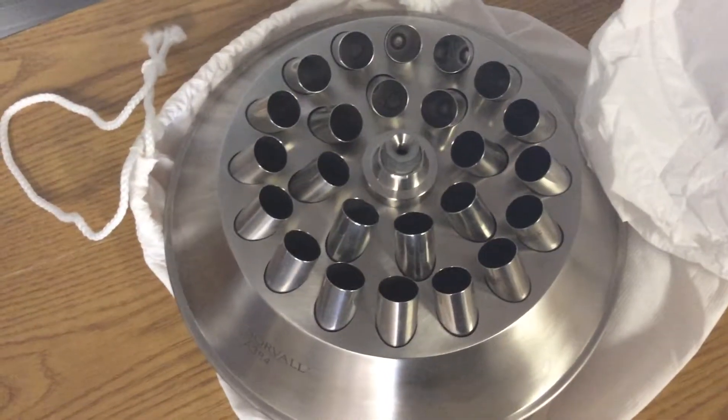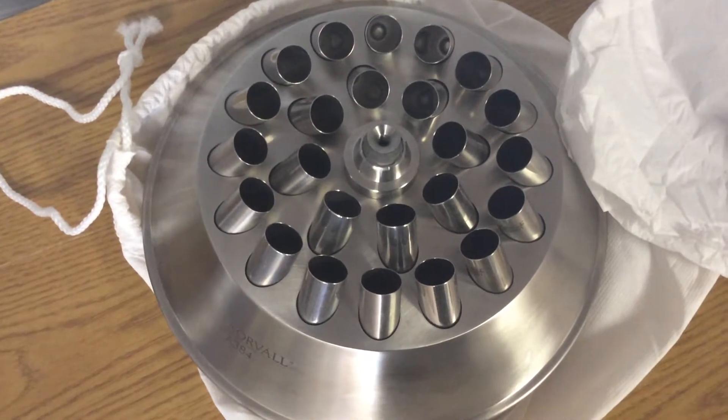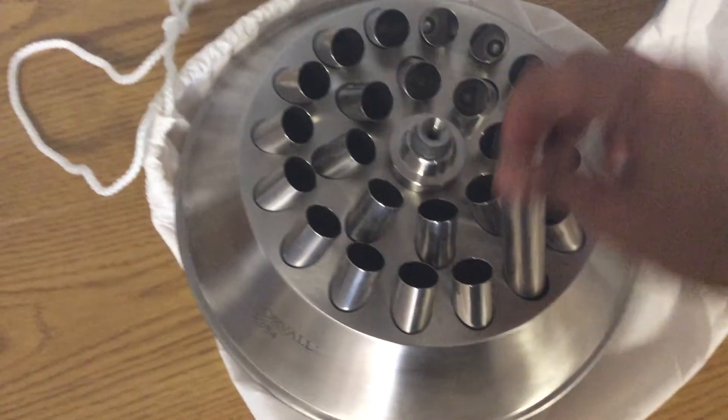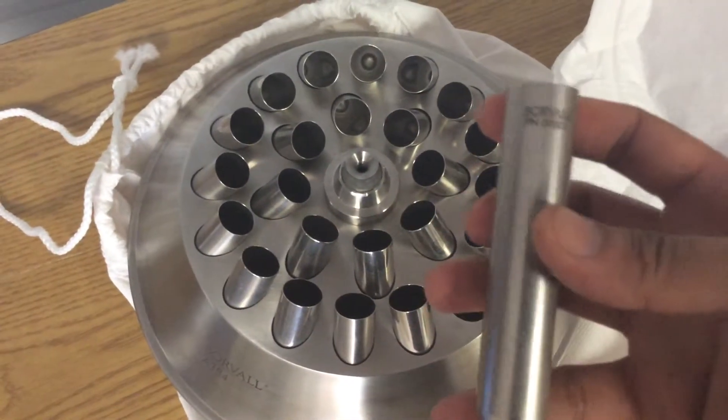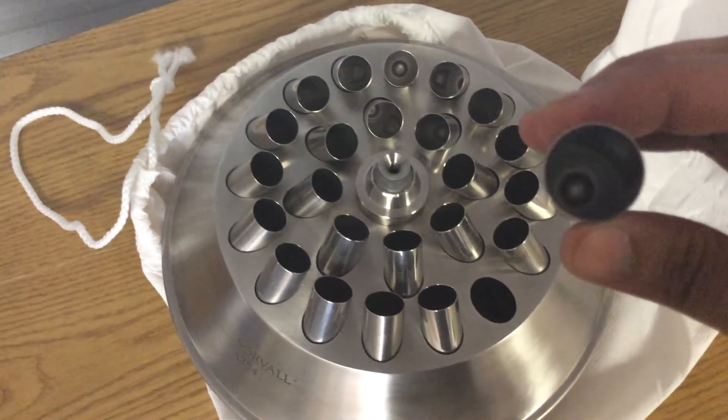24-place for 16 milliliter tubes. The part number for the tube is 00501, as you can see. And that's what it looks like.